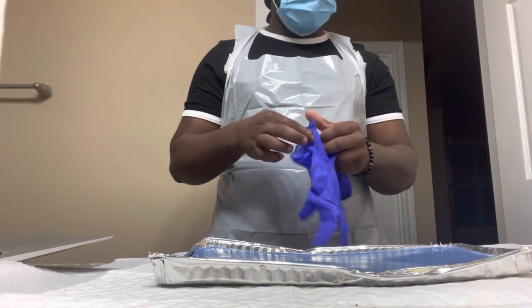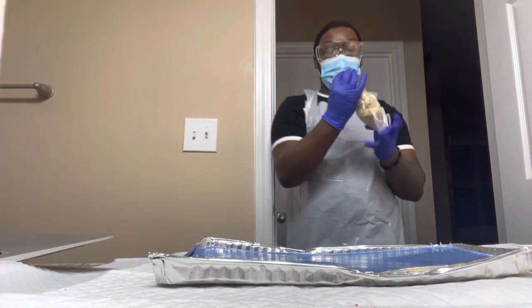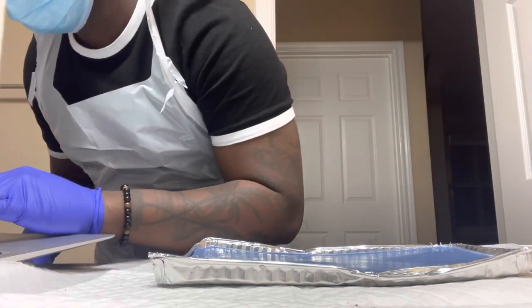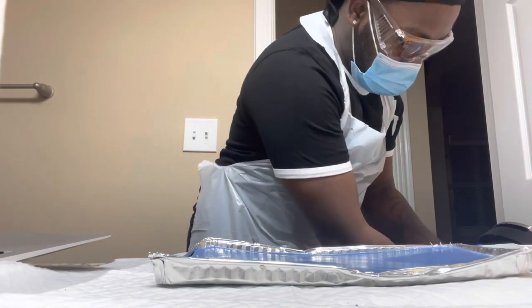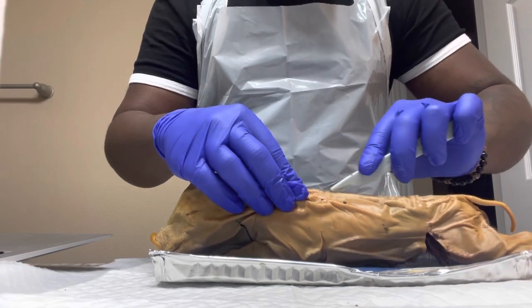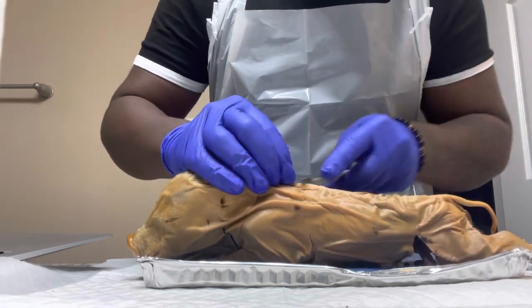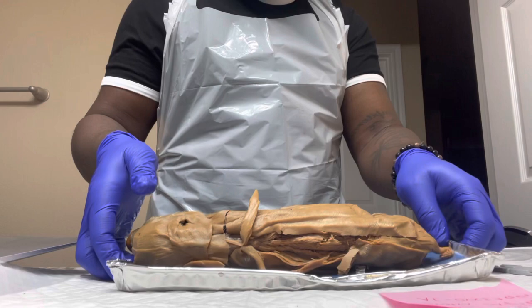We're doing the sheep brain next. Okay, now last thing is the sheep. There is a heart in there, but I don't think I'm supposed to do the heart right now. Let me go see. So, what is this? This is the sheep heart, but I'm wondering if this is A&P 2 too, because I don't see it on anything unless I missed it. Oh, they right. Sorry, we're gonna have to dig you from the grave. But I was supposed to cut you down your back. I didn't know, to expose your spine. Oh, I almost took his head off. Sorry, Wilbur, I'm just trying to get a good grade. I just want an A. Okay, so yeah, I think I was supposed to do it that way, and that's the spine. But yeah, so back on to the grave. Going away under.